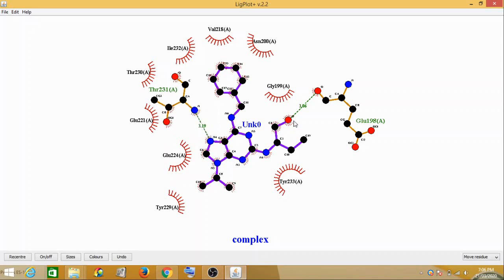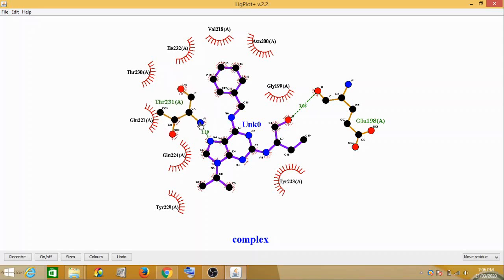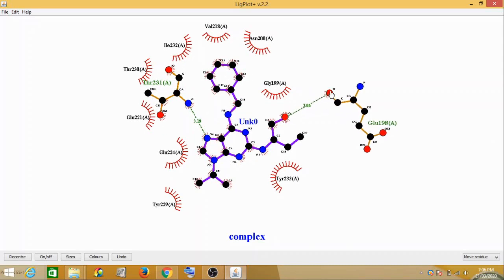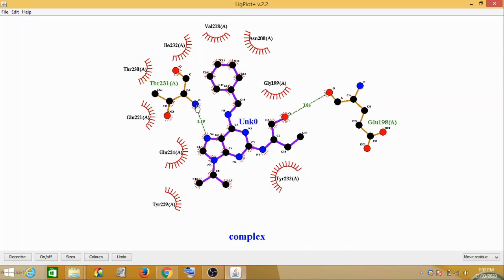So your ligand here has carried out an interaction. Mostly if you see, the ones which are in green, these are your hydrogen bonding. So the two molecules have interacted at this region, having a hydrogen bonding with your ligand.